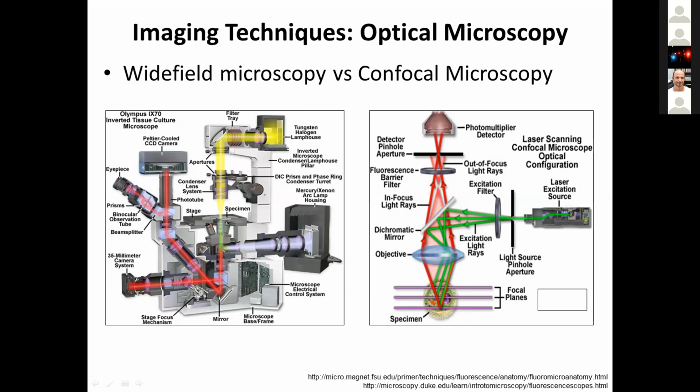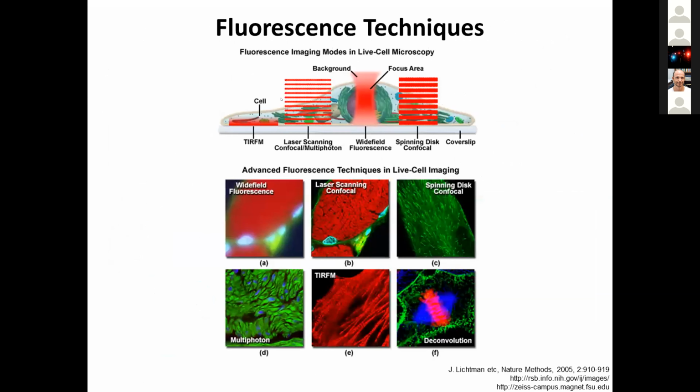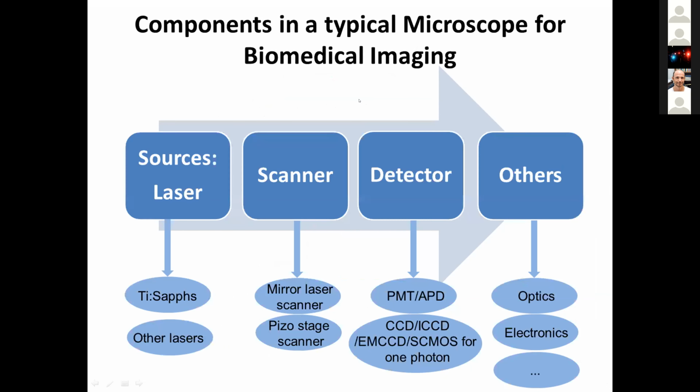On the way back, this dichroic mirror enables the passage of the fluorescent light, which is usually of longer wavelength than the excitation. Then we have another set of filters that select the band that we want to collect, and then we have different configurations, eyepieces or cameras, different kinds of cameras with different paths. You may notice that here we collect all the light coming from up and down of the focal point that we are interested in.